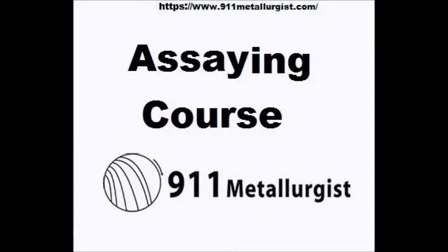With a set of gram weights and its subdivisions, anything may be done. If it is desired to report as pounds to the ton, then, since there are 2,240 pounds to the ton, a weight of 2.240 grams may be taken as the assay ton, and each 0.001 gram yielded will equal 1 pound.